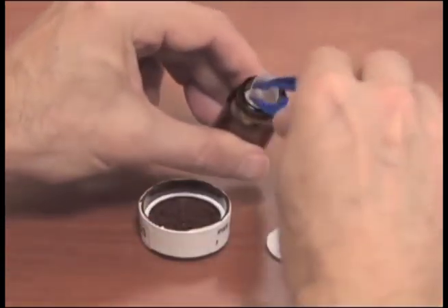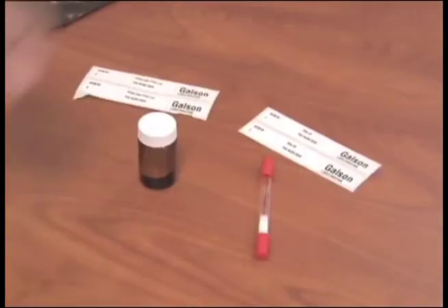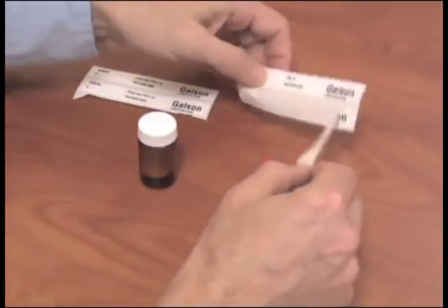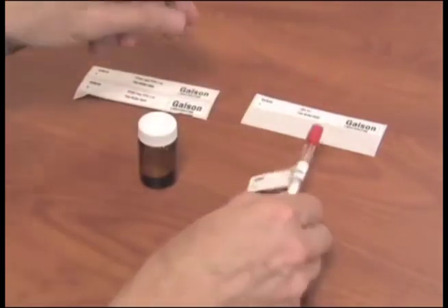Using tweezers, remove the filter only and place it in the vial and seal. Label both the capped Orbo 43 tube and the vial with the filter inside with the same sample ID, and place both inside the light-sensitive bag.